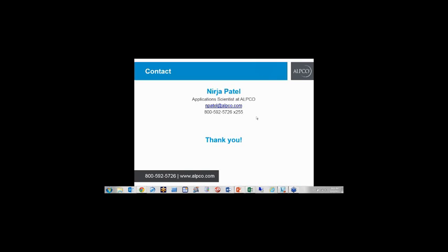What staining conditions are used for the antibodies? What we routinely use, for the plots you saw today, maybe Pam can help me with this, I think these were two-stage stains. Yes. So we use unconjugated primary antibodies, and the secondary antibodies were conjugated. The staining conditions I prefer are to do the stains on ice for roughly 30 minutes with each reagent, and then wash between, after staining with the primary antibodies before the secondaries.